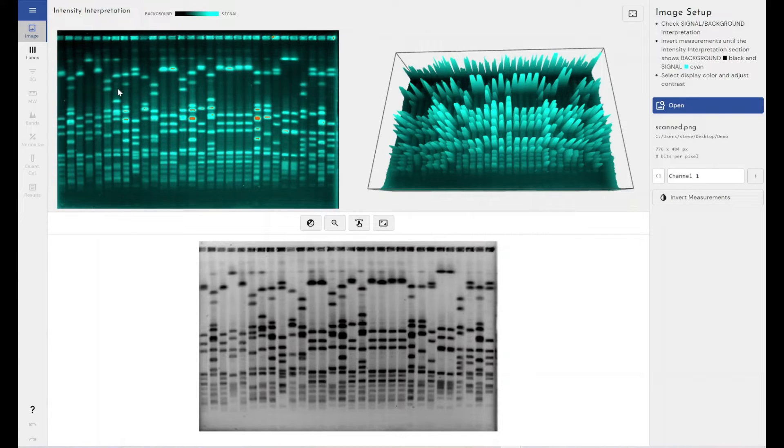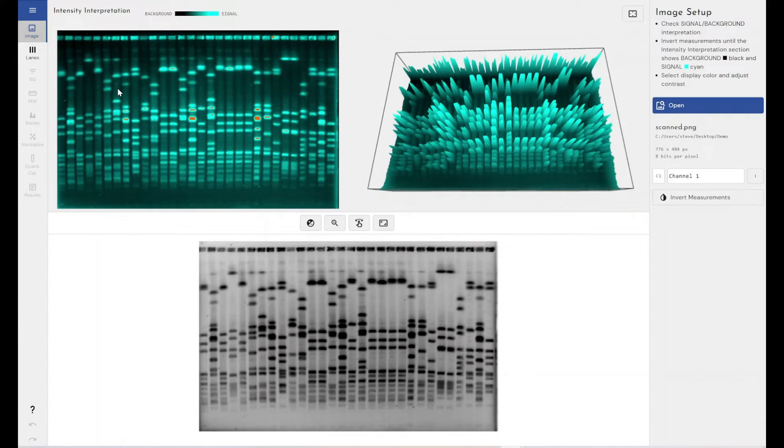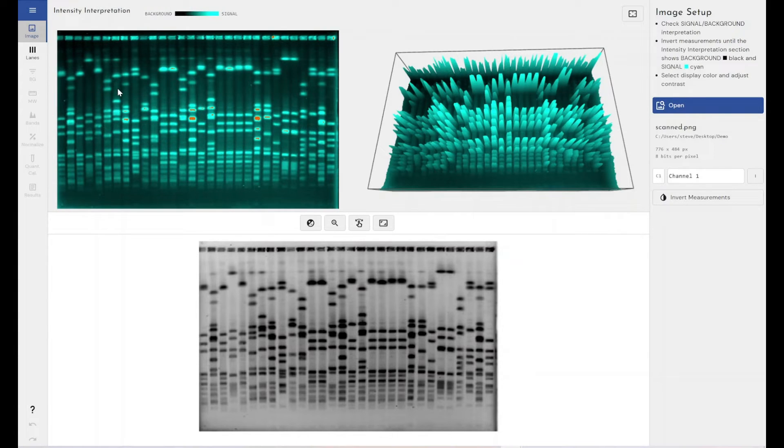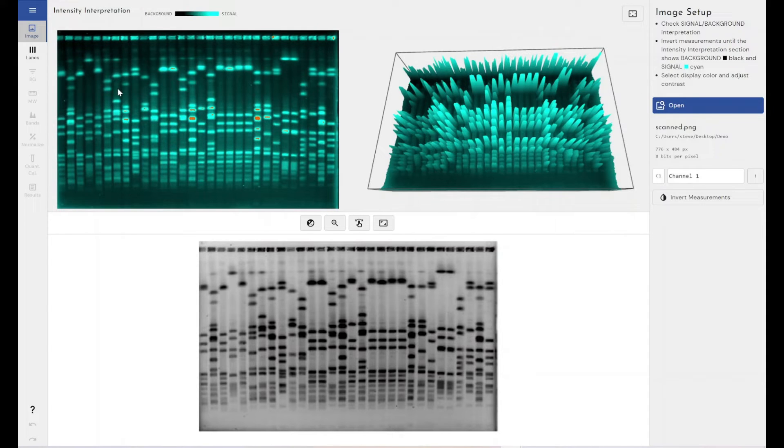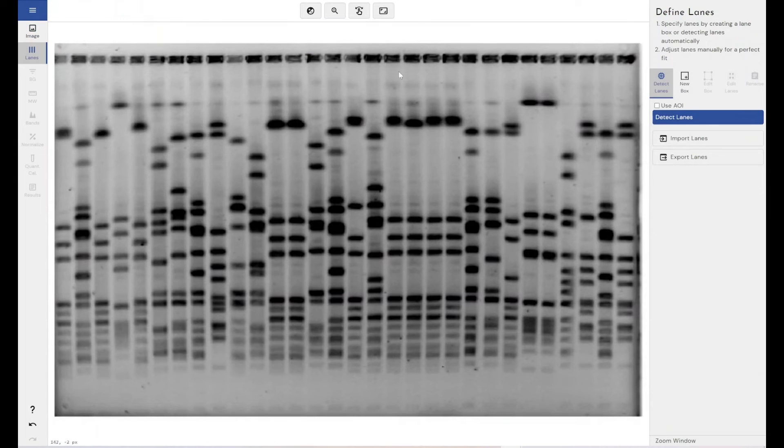Which means that it works best when you've got a standardized workflow where you've got the same number of lanes in every gel. You've got the same background removal technique used, the same kind of settings. You've got the same kind of band intensities, so the same band detection settings will work. So it's very much a standardized way of using your workflow. So if I come through and if I detect my lanes.